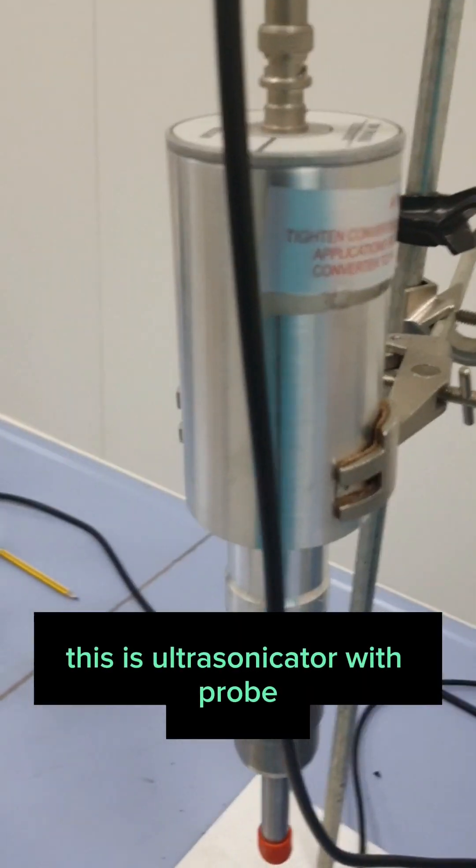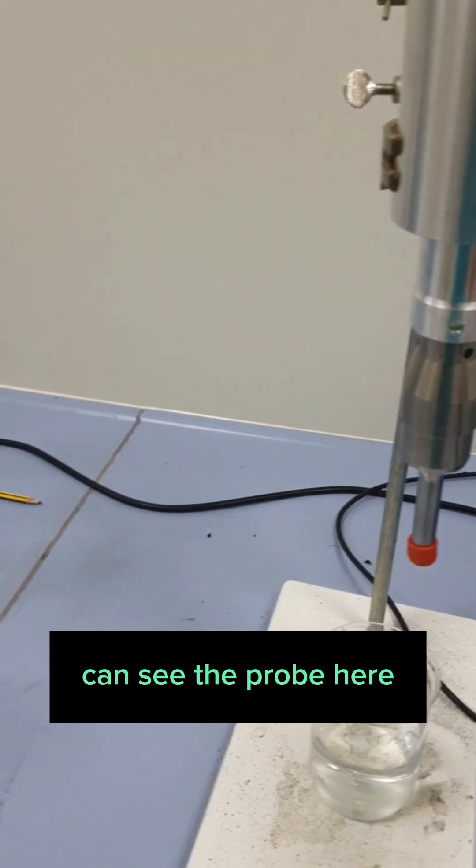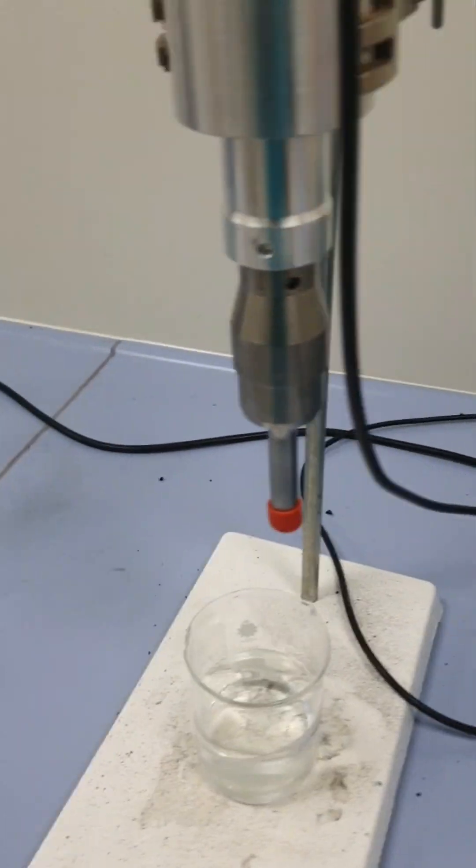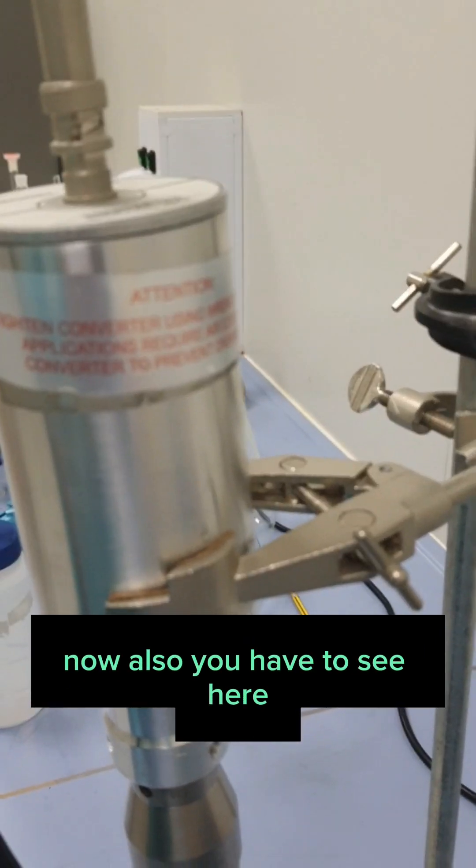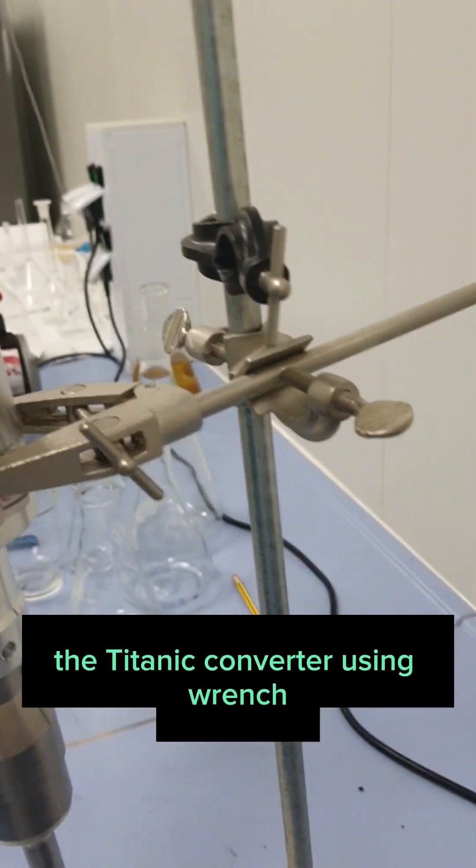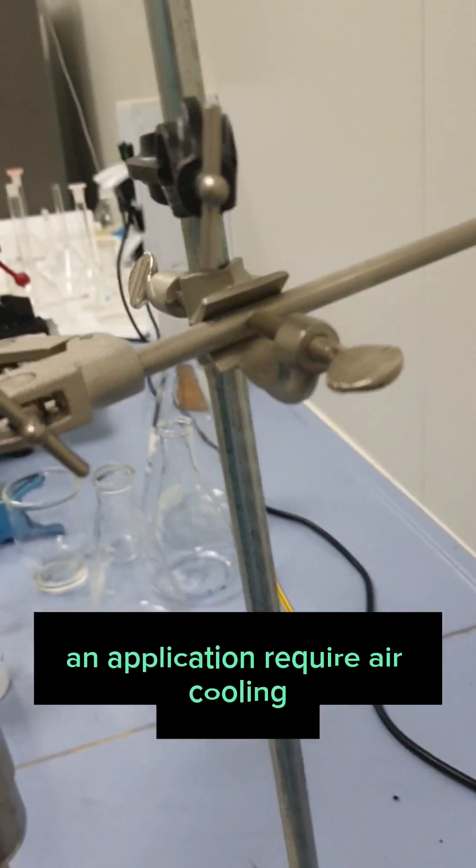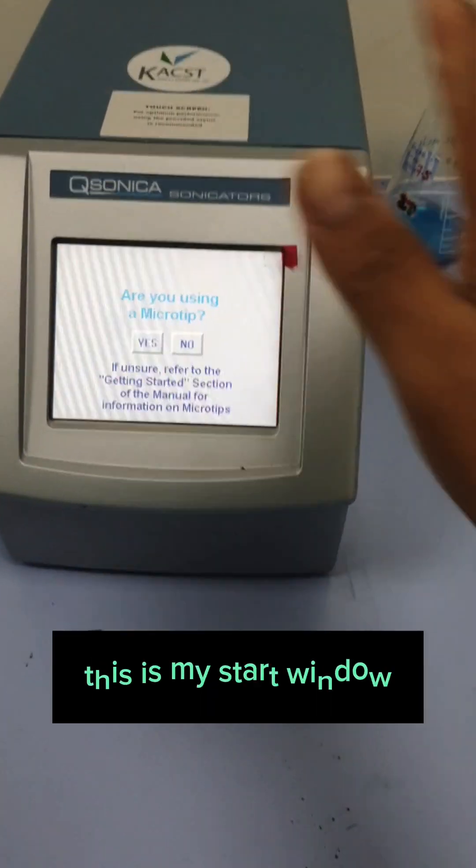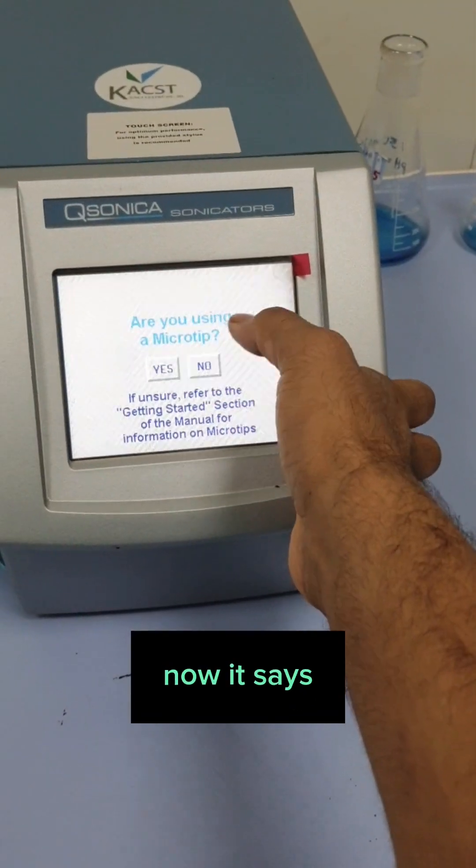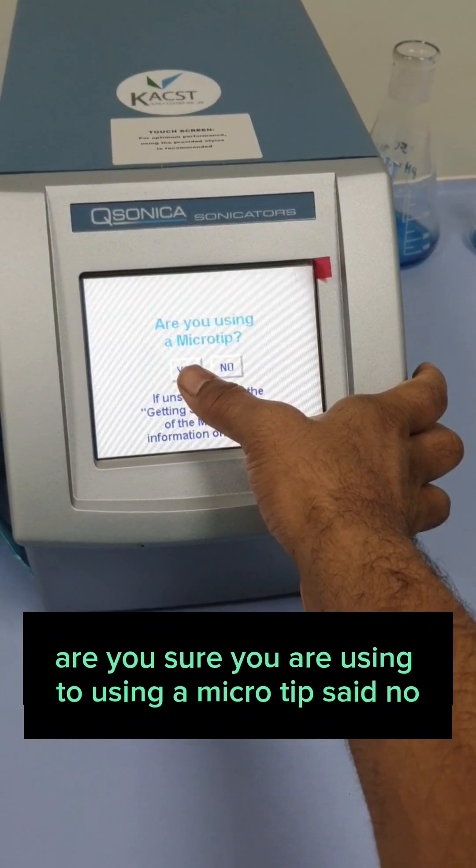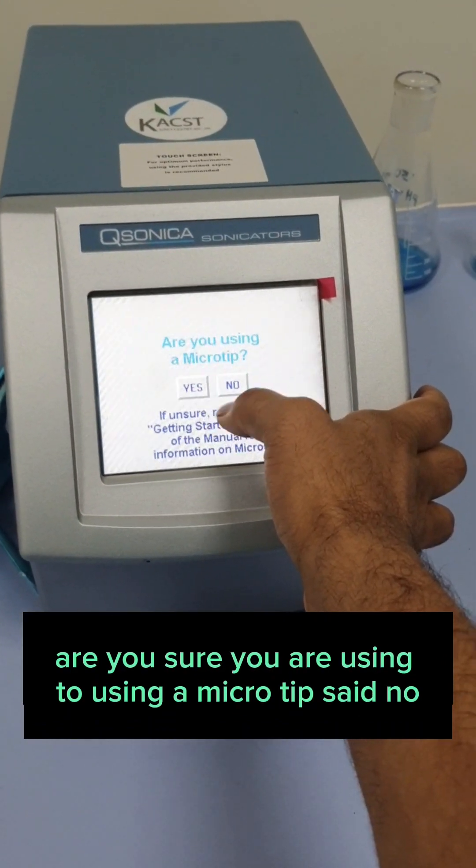As you can see here, this is an ultrasonicator with probe. You can see the probe here. This is not a micro probe. Also, you have to see here, tighten the converter using wrench. An application requires air cooling. This is my start window. It says, are you sure you are using a micro tip? Say no.